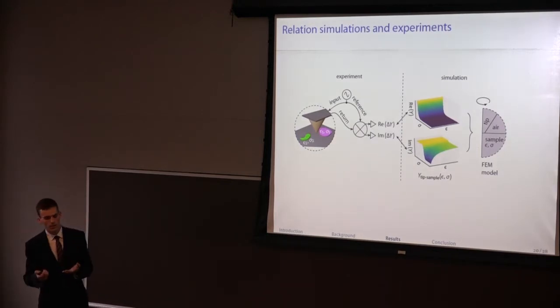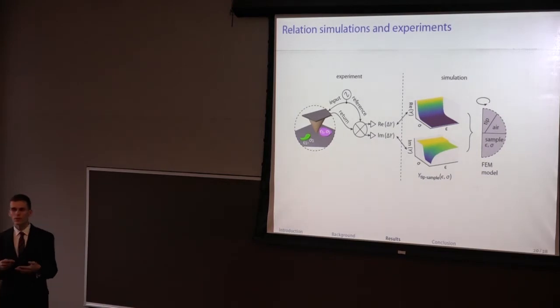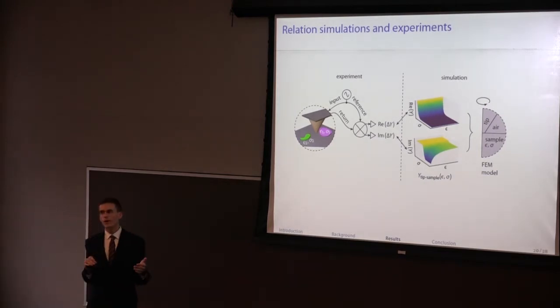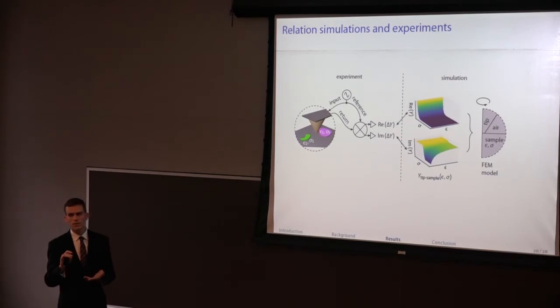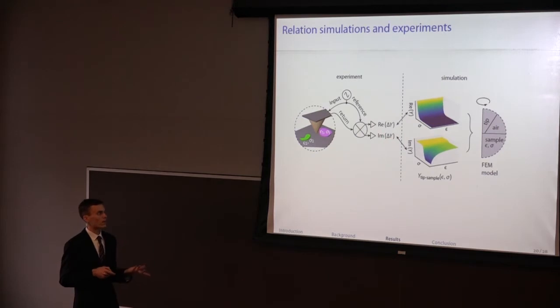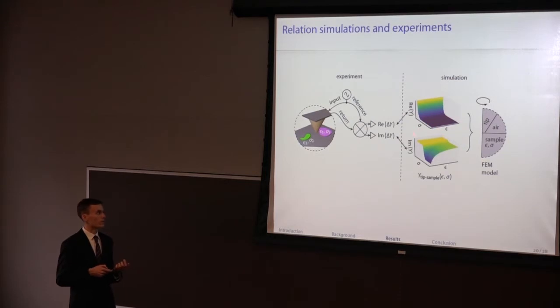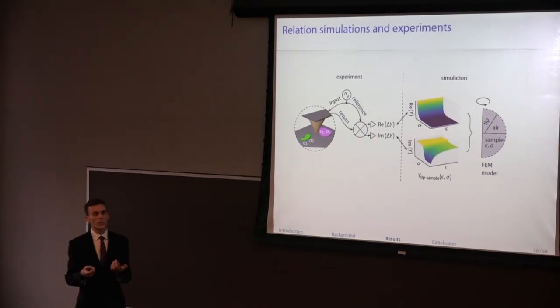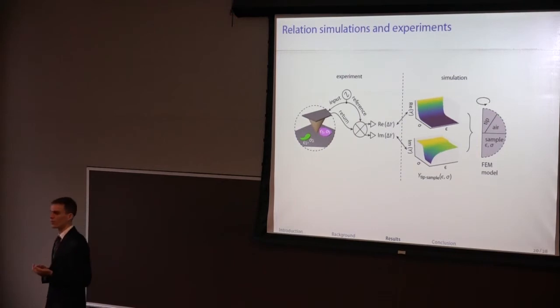We do need additionally some way of mapping the output of the instrument, which is actually just the output of an amplifier. It's just in volts. We do know that the voltage levels correspond to differing conductivities or permittivities, but we don't actually have any reference there. We just know maybe one region is more or less conductive than another. So how then do we relate those to absolute values of admittance in these finite element simulations, where I can sample the entire space of sigma and epsilon, or the relevant space, and generate these functions for the real and imaginary tip sample admittances? So what's our bridge there?